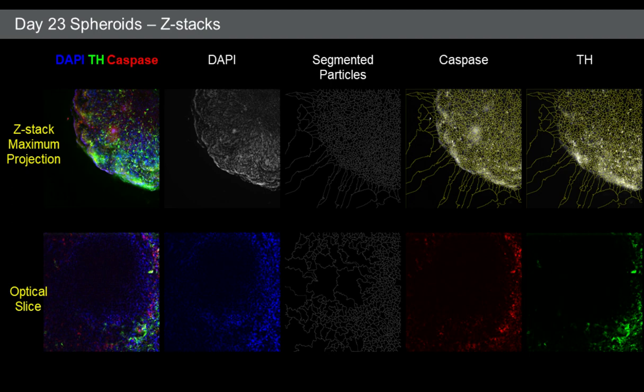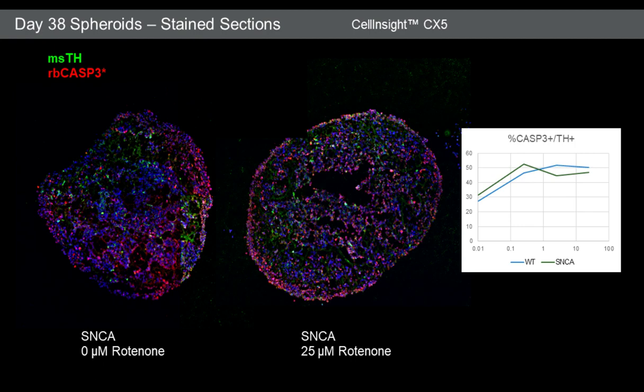But what we're actually doing is the same process on every optical section. And this allows you to more narrowly focus on the cells that are in focus in each section. It's very data and labor intensive. So given the slow progress on this, we're starting to focus on work in cryosectioned organoids instead.